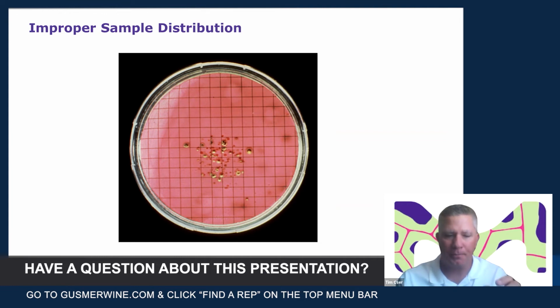Think about a kitchen sponge. When we take our kitchen sponge and we put a drop of water on it, does it come through the other side? No. There's electrostatic forces, hydrophilic forces that are allowing that liquid to then be absorbed onto the filter and not filter through. And that's what can happen, you can just have that sample stick on the filter and all the organisms are there in the middle. So you want to make sure that you have a pre-wet filter, if you're having issues with either having bugs inhibited by the product, or you're having something like this where your sample distribution is too tight because you're not doing sample dilution. Next slide.